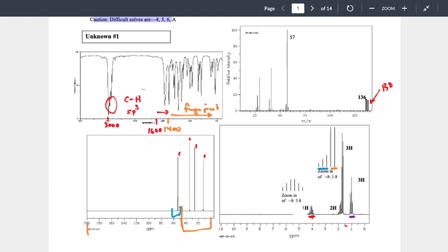So what I can now do is take advantage of that information and go through and provide an interpretation of what that chemical shift meant. Okay? The first part of that interpretation is insanely easy and everybody screws it up. I have a signal in my HNMR. What does that mean? There's hydrogens. You have a hydrogen. That's pretty important. So, hydrogen, hydrogen, hydrogen, hydrogen.